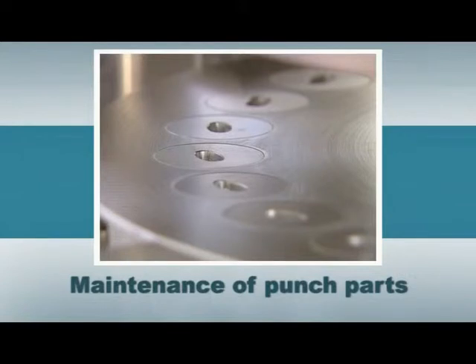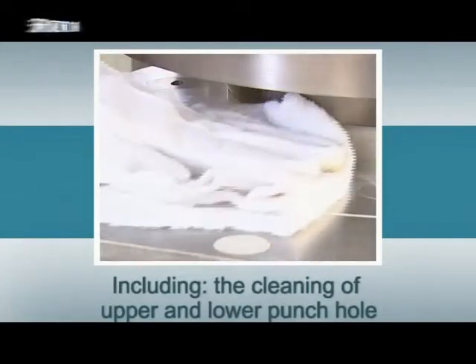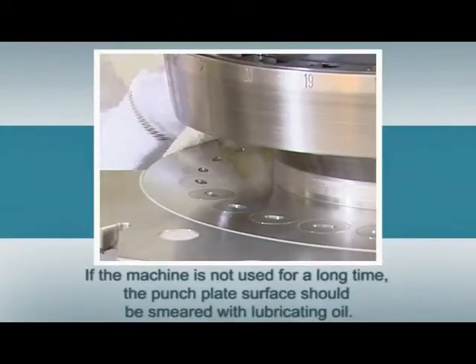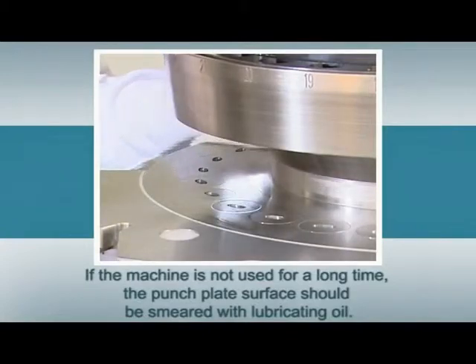Maintenance of a punch part. Wipe the punch parts when cleaning the machine every time, including the cleaning of the upper and lower punch hole, middle module surface, and major module hole. If the machine is not used for a long time, the punch plate surface should be smeared with lubricating oil.